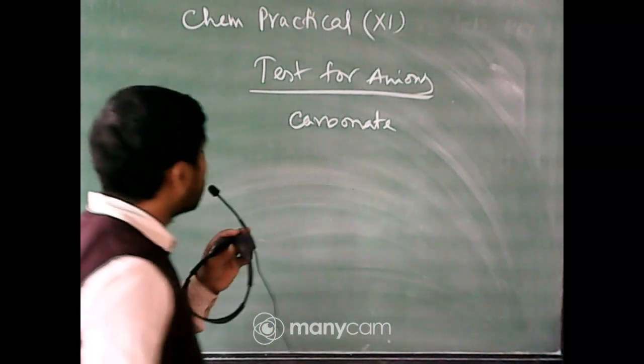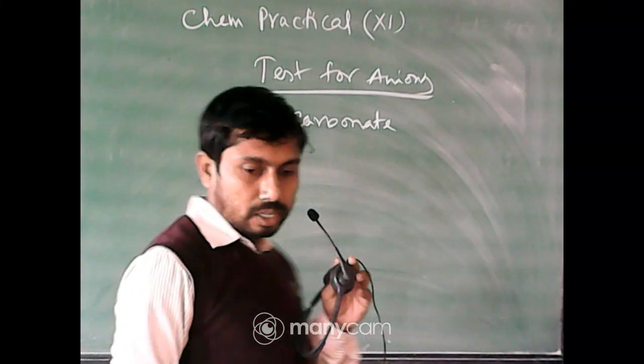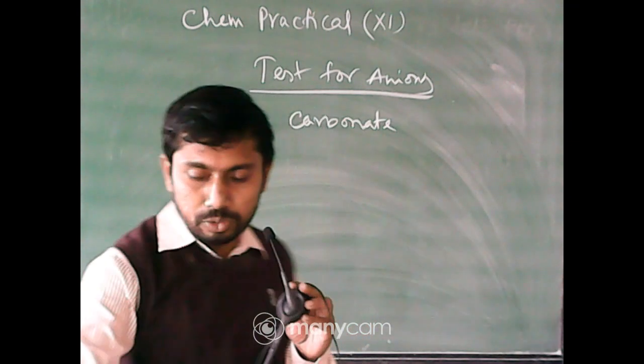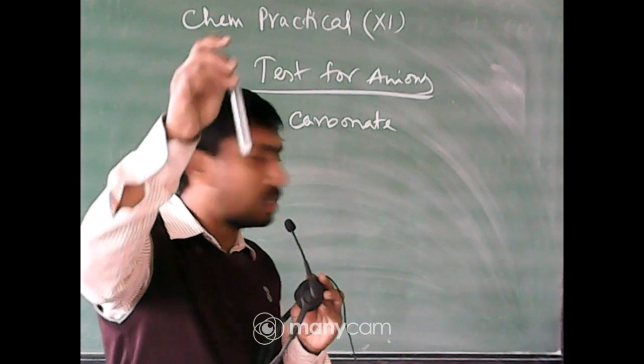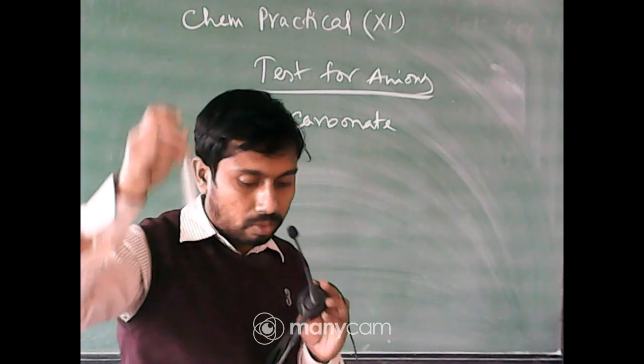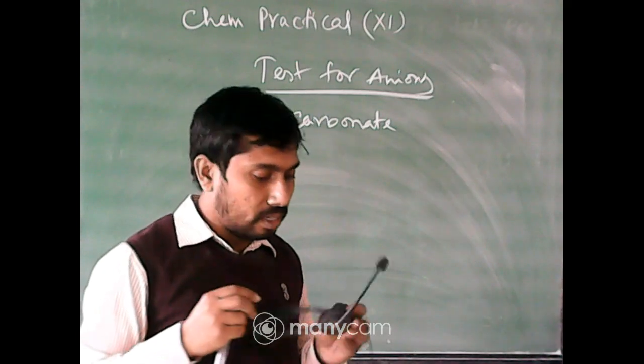So today is the test for anion and test for carbonate. Okay. So for this, what we have to take, I have already taken one carbonate sample here, which is solid. Now I will add here.